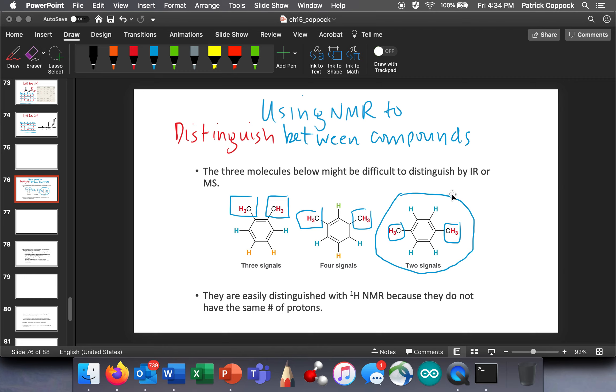And it turns out that if we use NMR to analyze these, they're going to be very different because very easily we can distinguish between them. Because if you look here, we've got, let's go here.